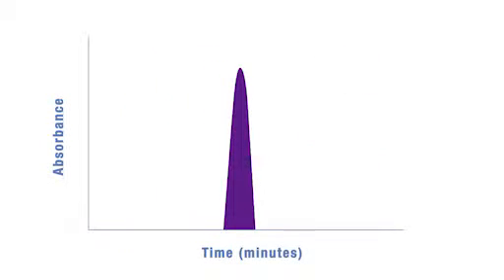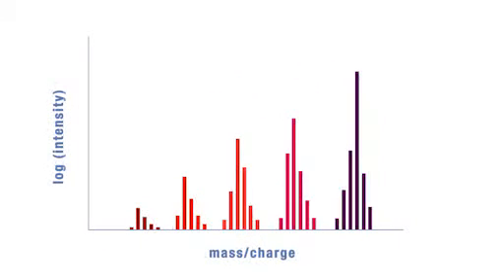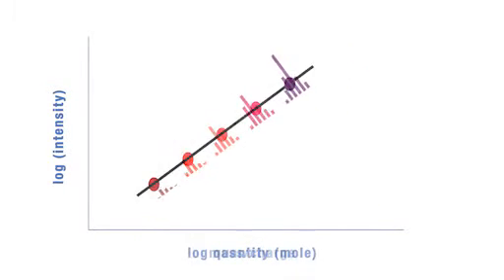Chromatographically, each of the isotopologues is indistinguishable. However, since they differ in mass, they are clearly resolved by mass spectrometry. The range of the concentrations causes the peaks to vary in intensity. This unique format allows you to monitor the dynamic range and sensitivity in one run.